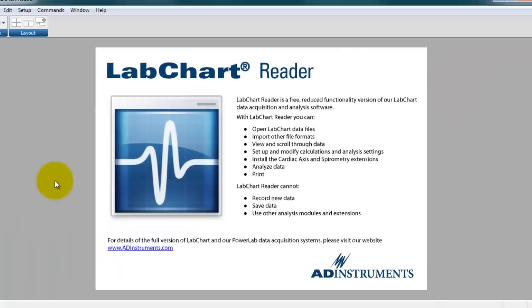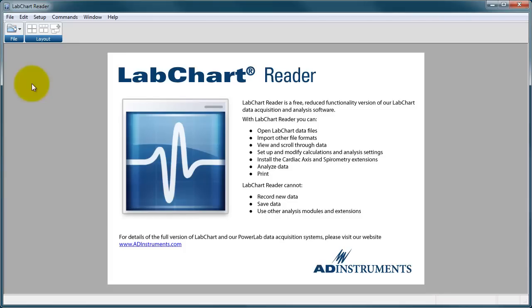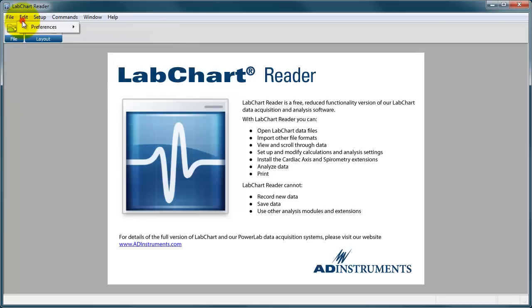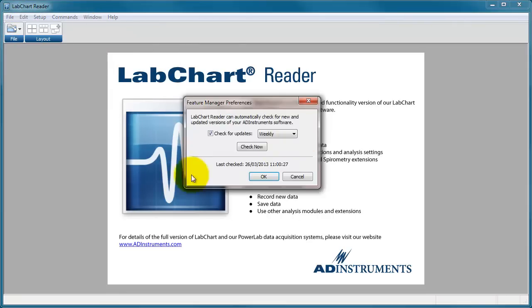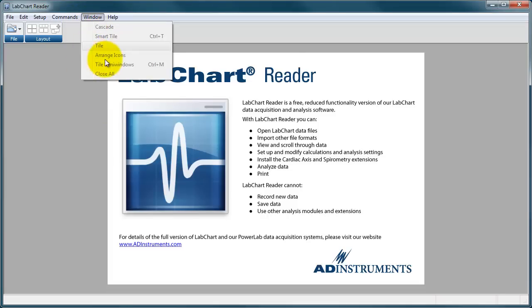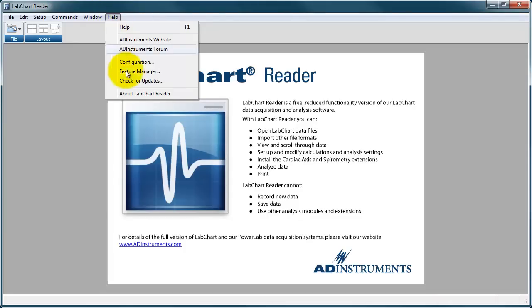When you open LabChart Reader, it's a standard Windows or Mac program with the usual menus at the top. Under Edit, in the preferences window, there's the feature manager which lets you check for updates — I recommend leaving this on to ensure you have the latest version. The setup command boxes don't do anything until you have data on screen, and there's a window menu and a helpful Help menu to visit the AD Instruments website, check for updates, and find functions.